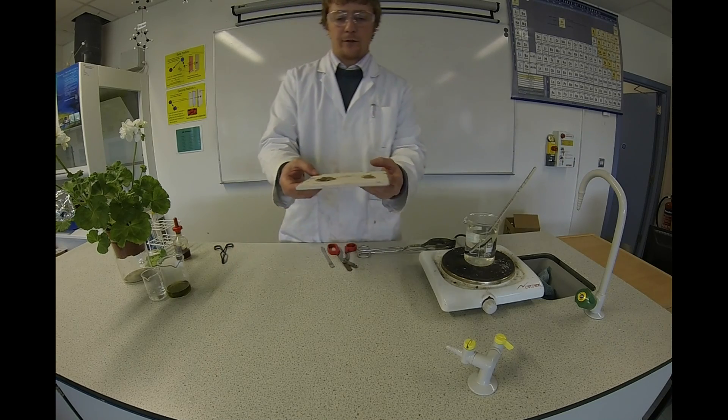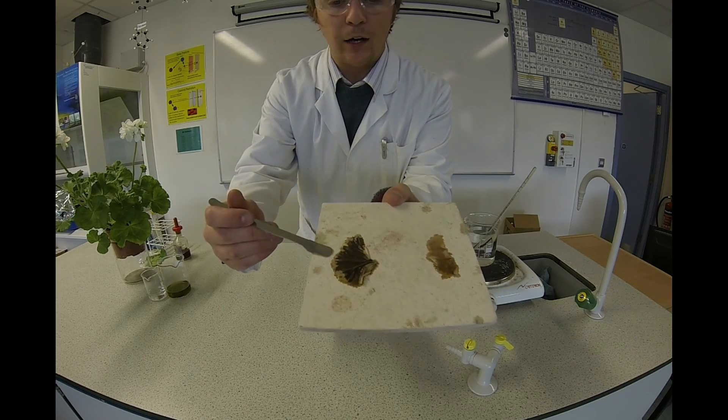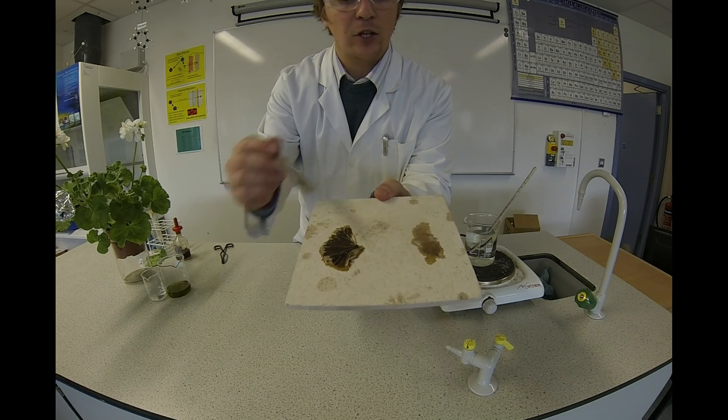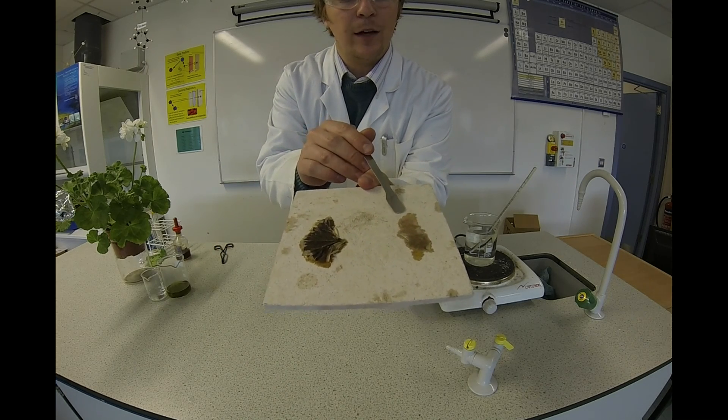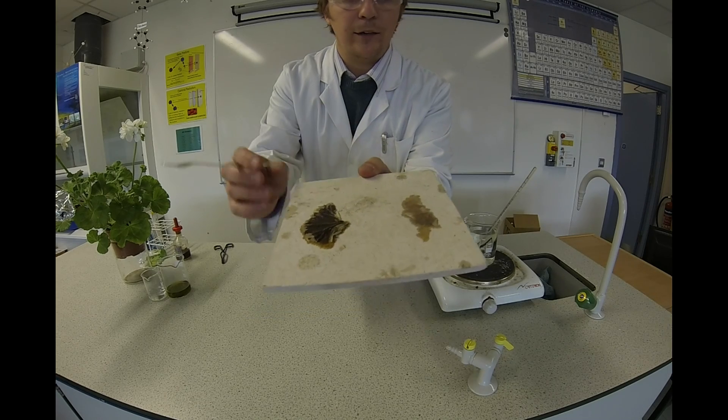We have some great results here. You can see clearly the photosynthesizing leaf has gone a dark black colour with iodine — that shows the presence of starch. The non-photosynthesizing leaf has stayed iodine colour, and that shows there is no starch present.